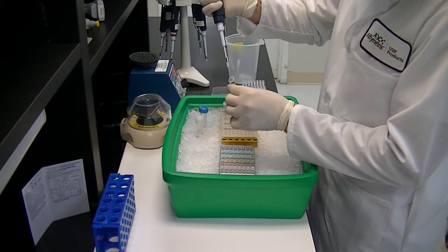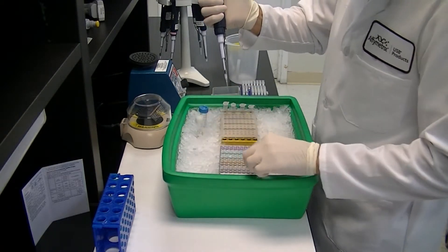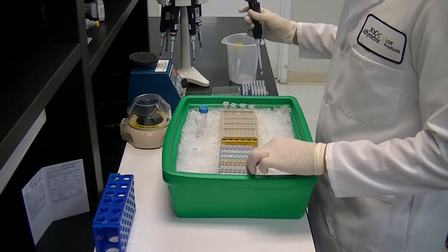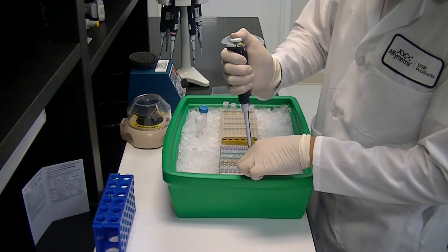Prepare the tenfold dilution series in water by adding concentrated cDNA to the first tube of an 8-tube strip for a 1 microgram input. It is important to mix well by vortexing or pipetting up and down.